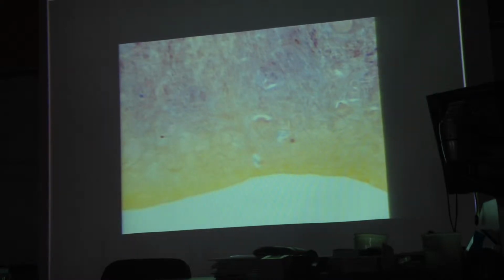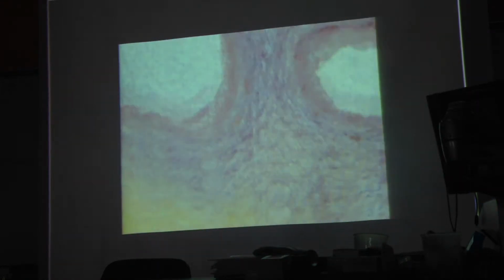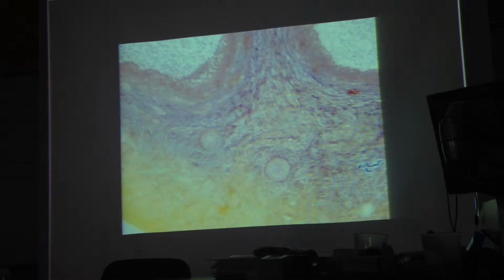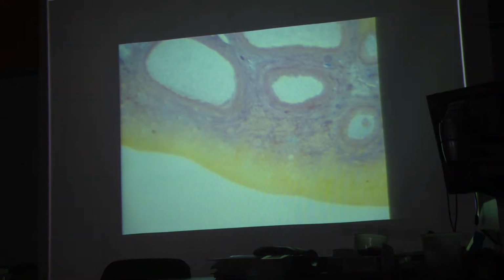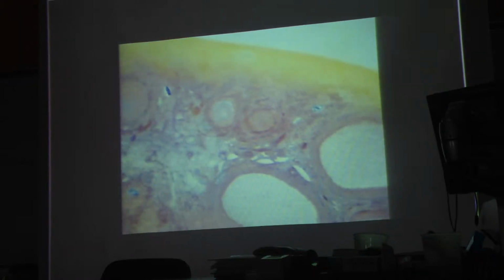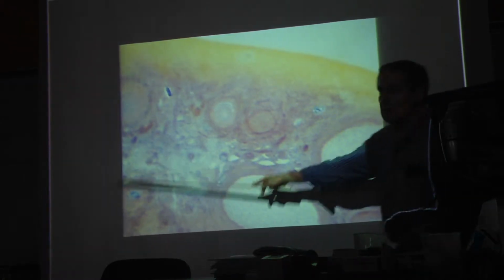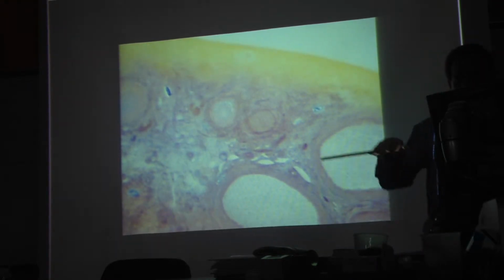Now there are two regions of the ovary which you've been able to identify. The outer region, where the follicles develop, which we see here, is called what? It's the cortex. This area where you see the follicles developing, that's cortex. The inner region has a lot of blood vessels and connective tissue, but no follicles, like we have in here. That's the medulla. You see that in a lot of organs. Outer cortex, inner medulla.